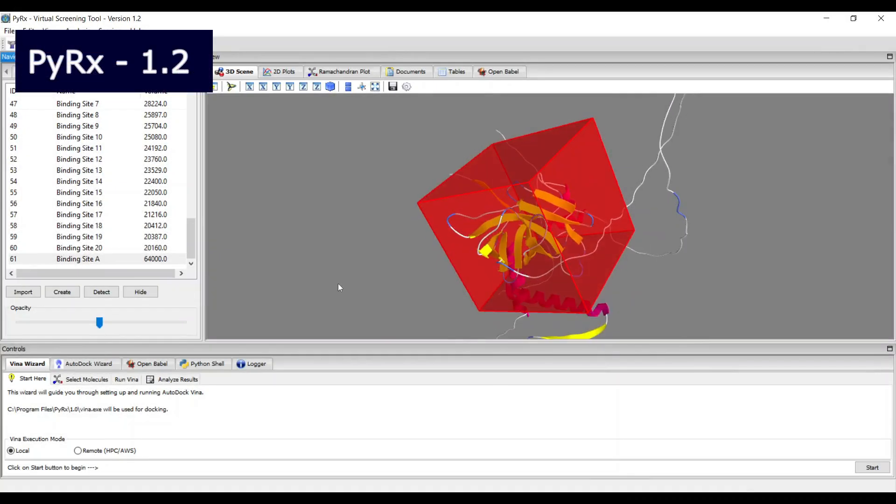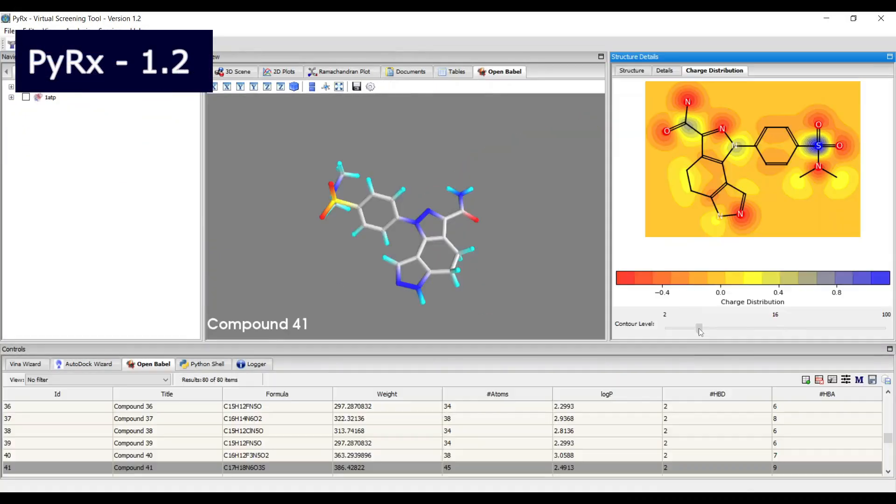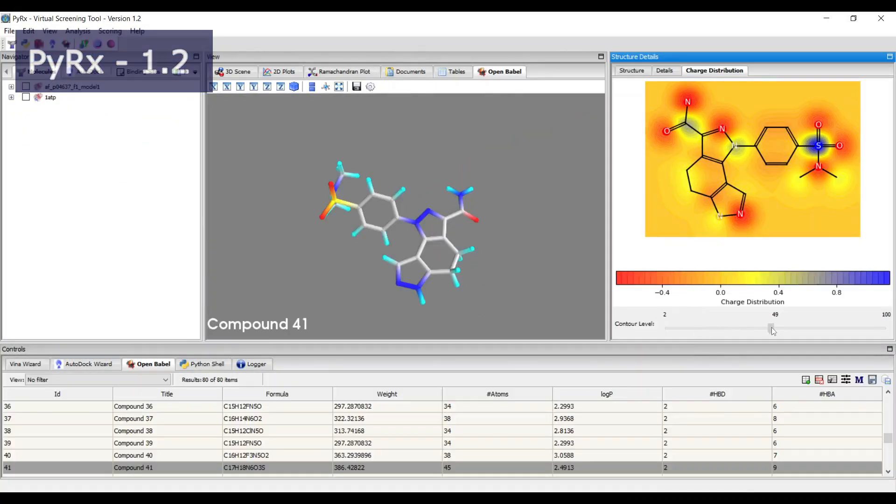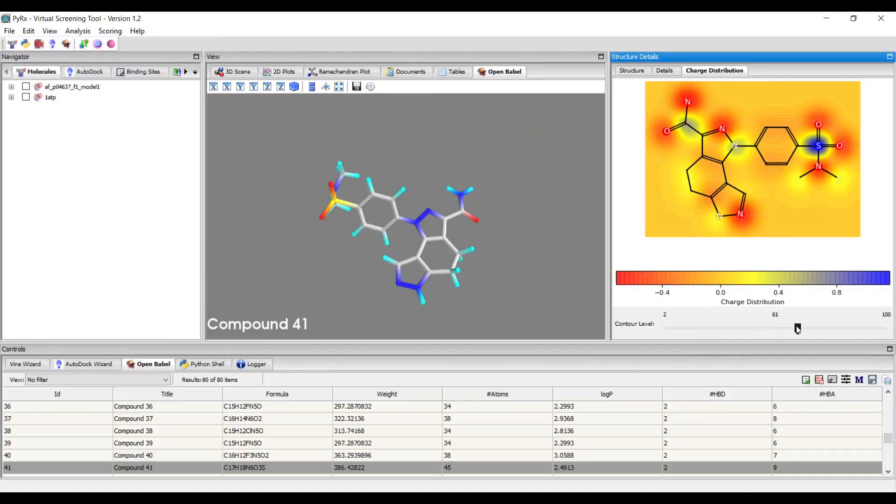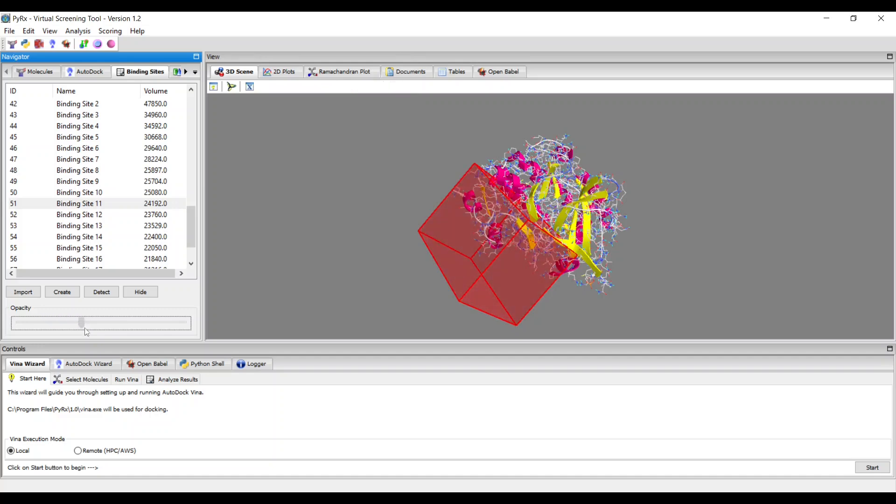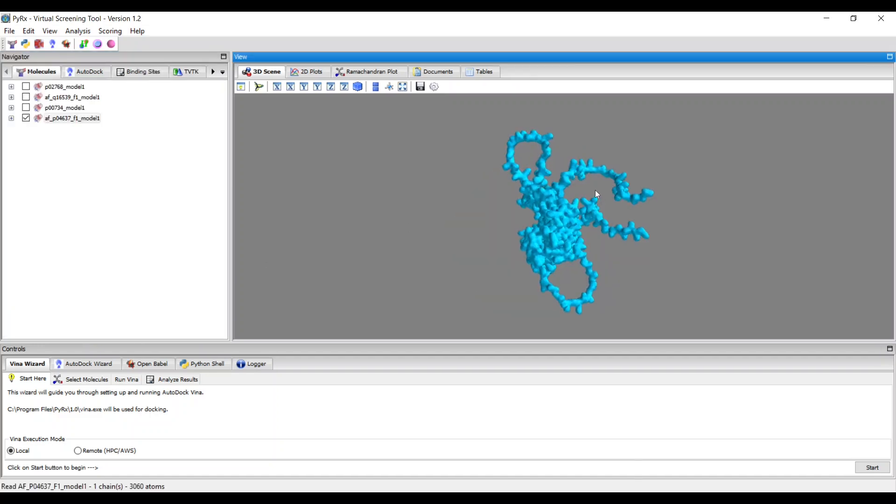Introducing Pyrex 1.2 version. This new release comes with significant features and improvements.